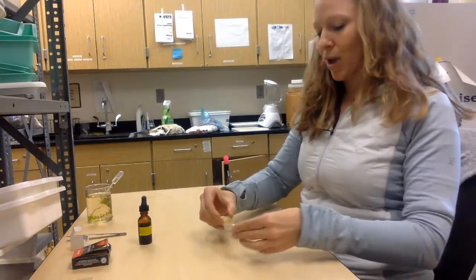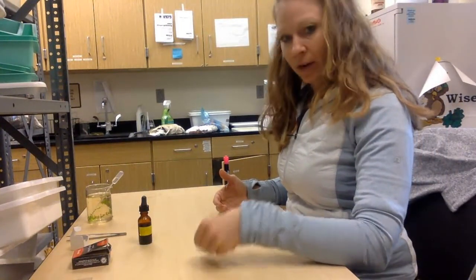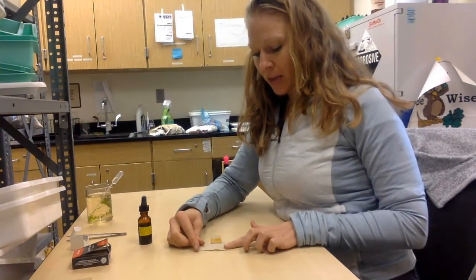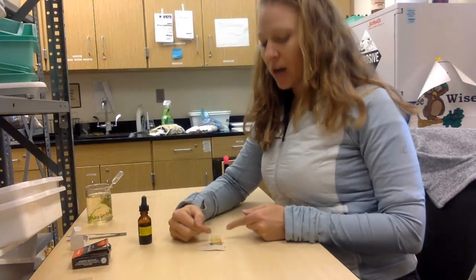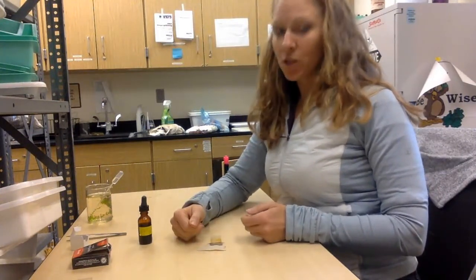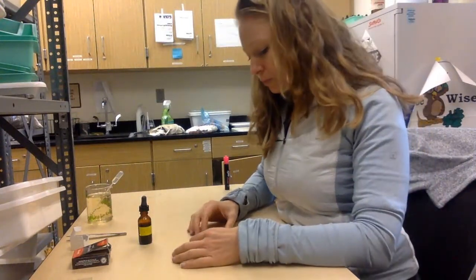What you need to do is drag that iodine across the slide. Pull it with capillary action. You can see I put a little piece of paper towel, and it's going to use capillary action to pull the iodine through. This is why you want to add enough water that you can allow for water movement underneath, but not so much that you have puddles of water coming off of the slide and going into the microscope.